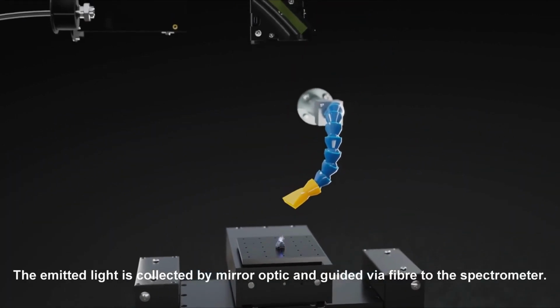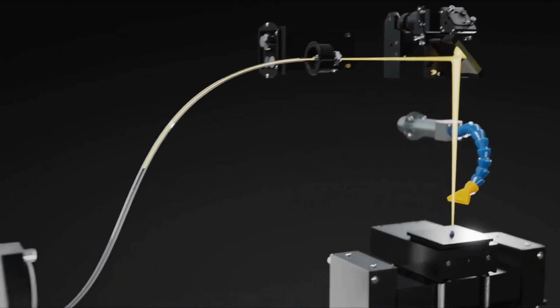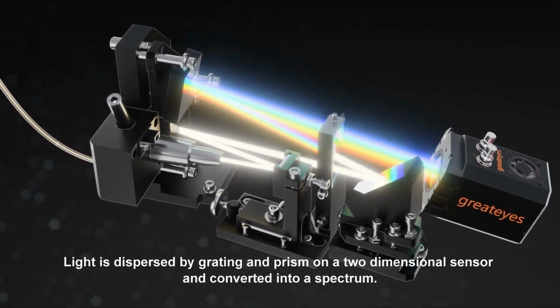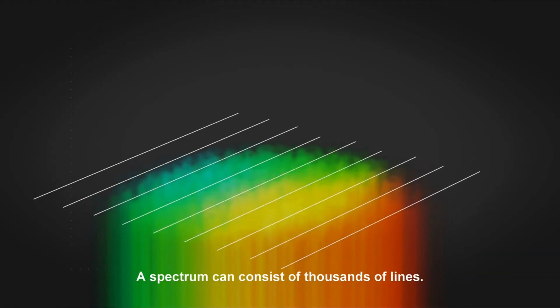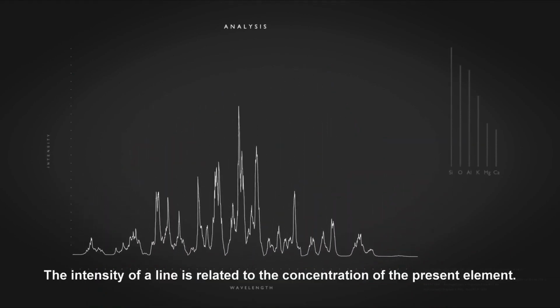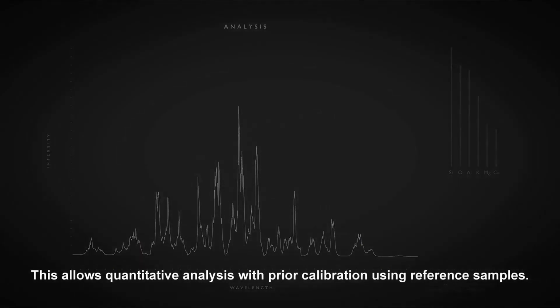The emitted light is collected by mirror optics and guided via fiber to the spectrometer. Light is dispersed by grating and prism on a two-dimensional sensor and converted into a spectrum. A spectrum can consist of thousands of lines. Each peak stands for an individual elemental emission line. The intensity of a line is related to the concentration of the present element. This allows quantitative analysis with prior calibration using reference samples.